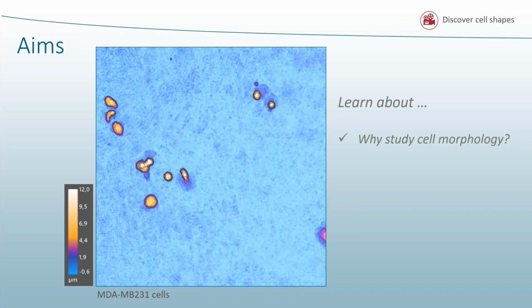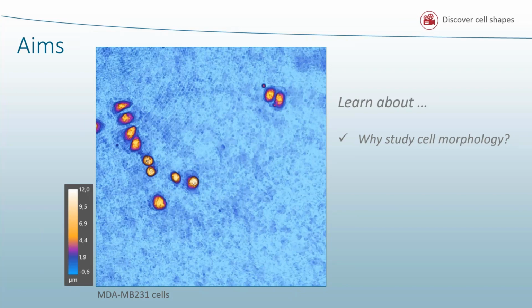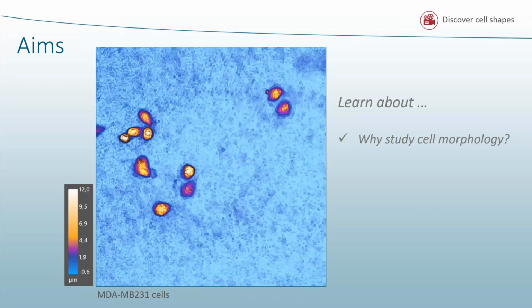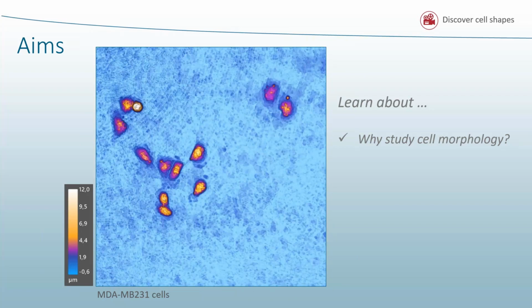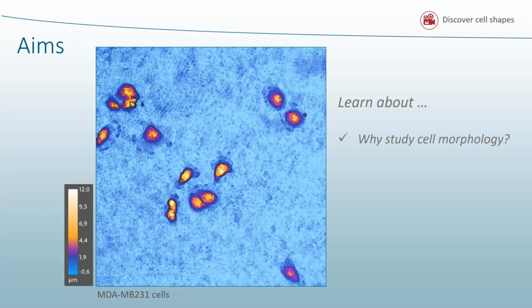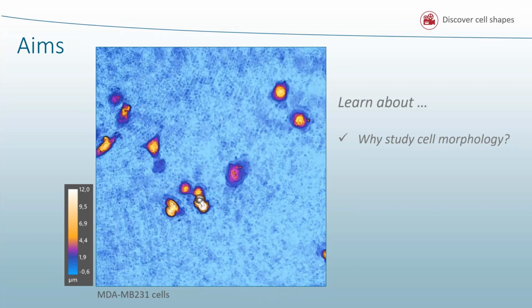And there you can see that even in a homogeneous cell culture, as this is supposed to be, cells have different shapes. And once they start moving, the shapes will differ every time you look at them. It's different. It depends on cell stage, cell density, cell movement. And when you study the morphology, you can tell a bit about the cell's life that you wouldn't know otherwise.